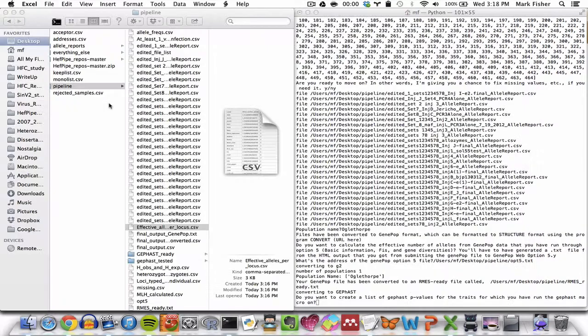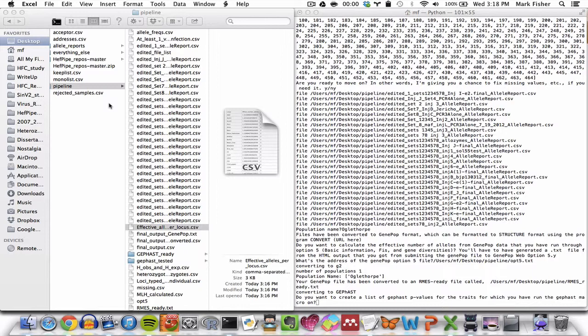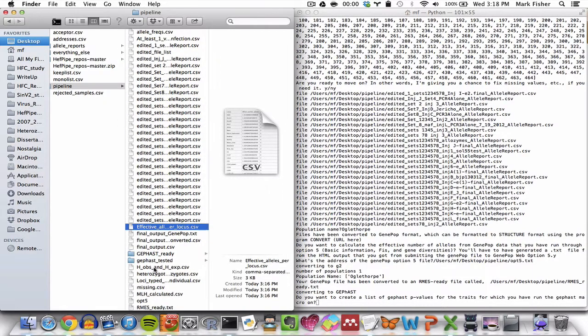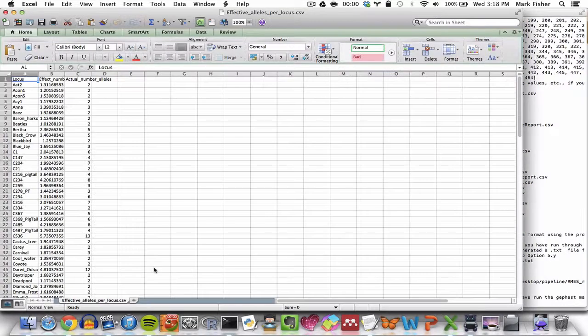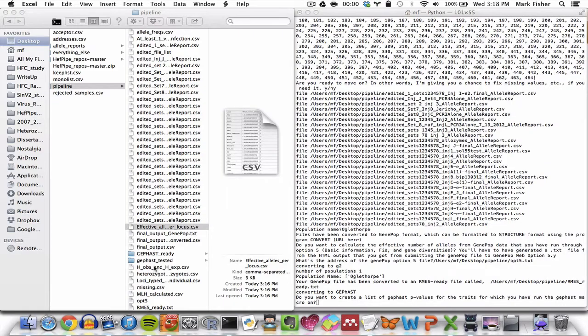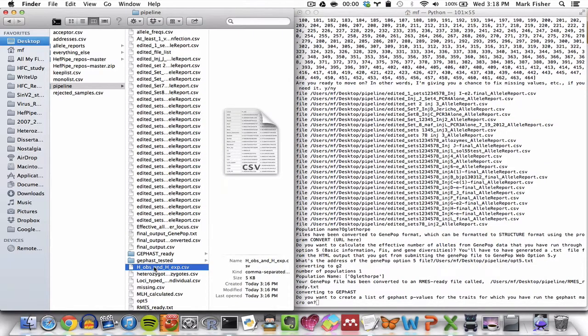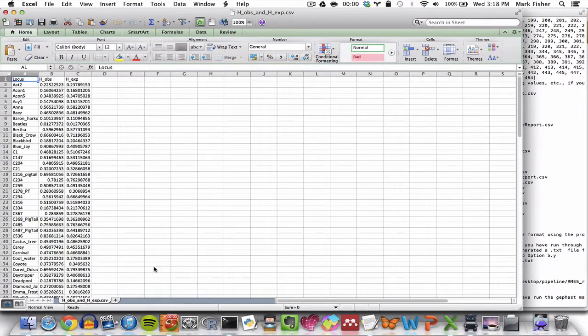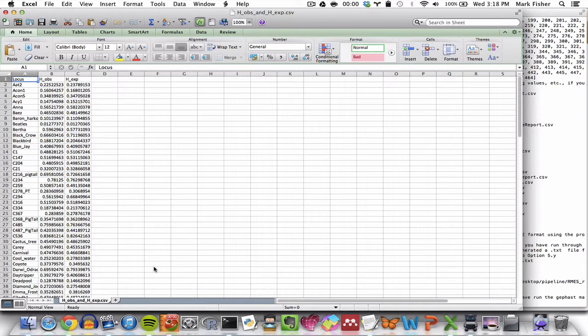Finally, the pipeline generates a CSV file called hobserved and hexpected, or hobshxp, which if we open, you'll see contains the observed and expected heterozygosities of each locus in the data set, and this is calculated by GenePop.